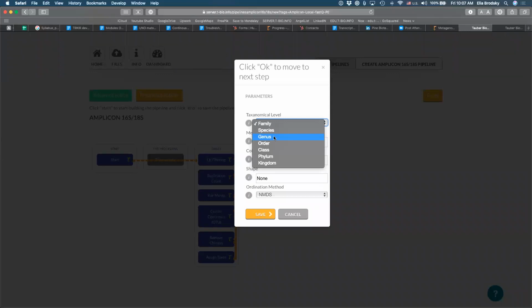Some will go to the species level. We looked at that table last time, and we saw that a lot of the annotation will just be not available below the species, definitely, but a lot of times also below the genus level. If we want to get all the information that this kind of sequencing provides us, and different types of hypervariable regions provide different levels of taxonomy, we can map it appropriately.